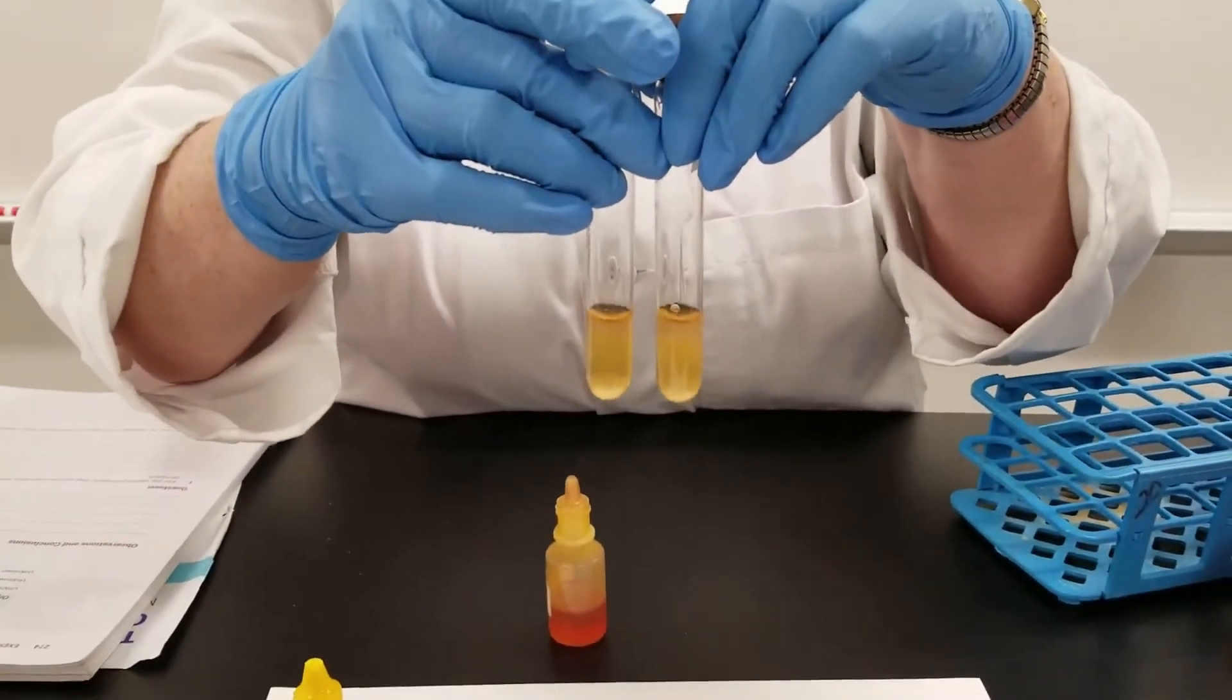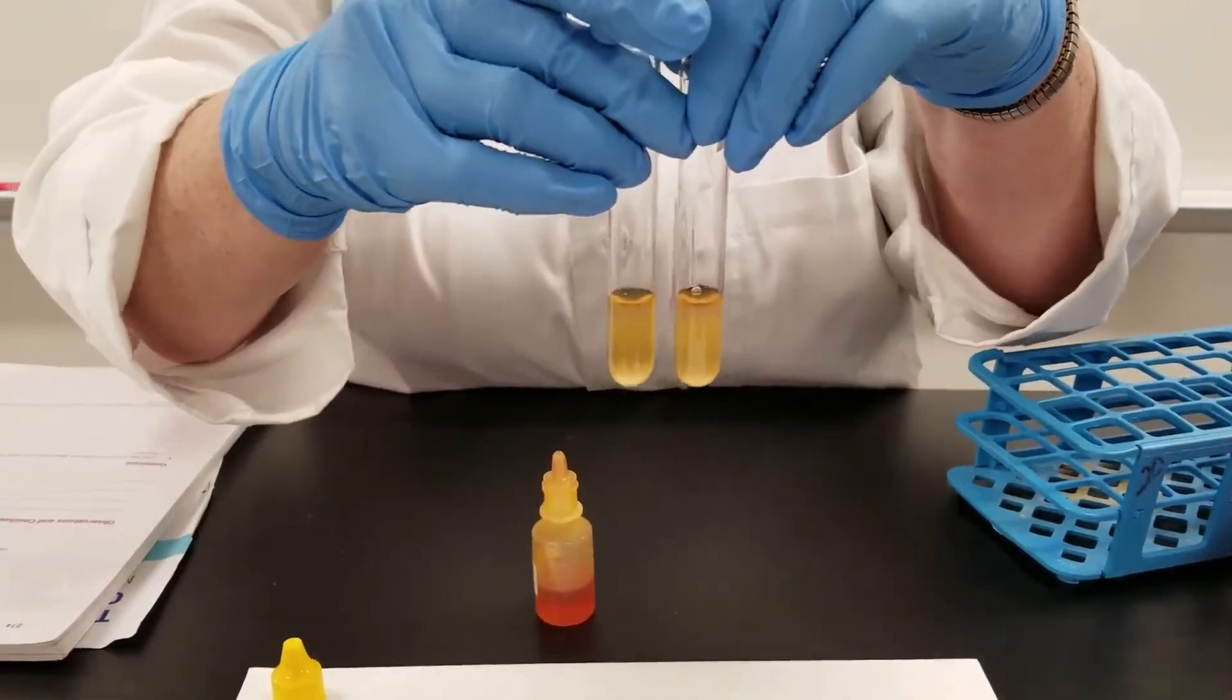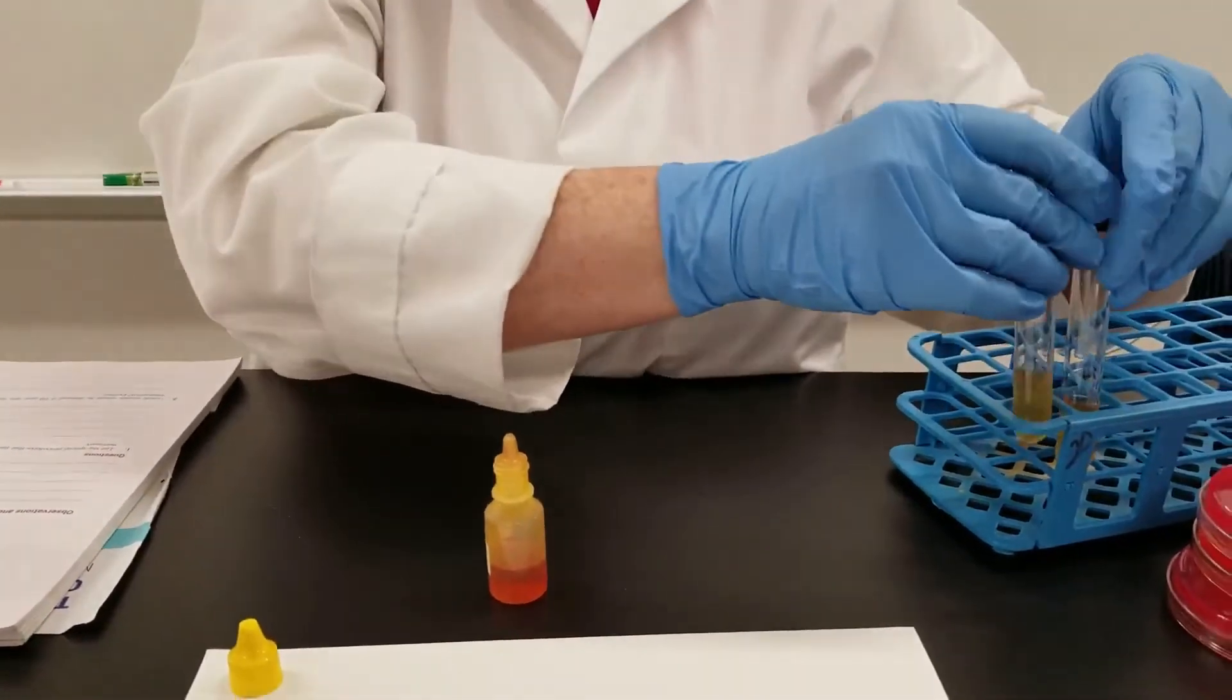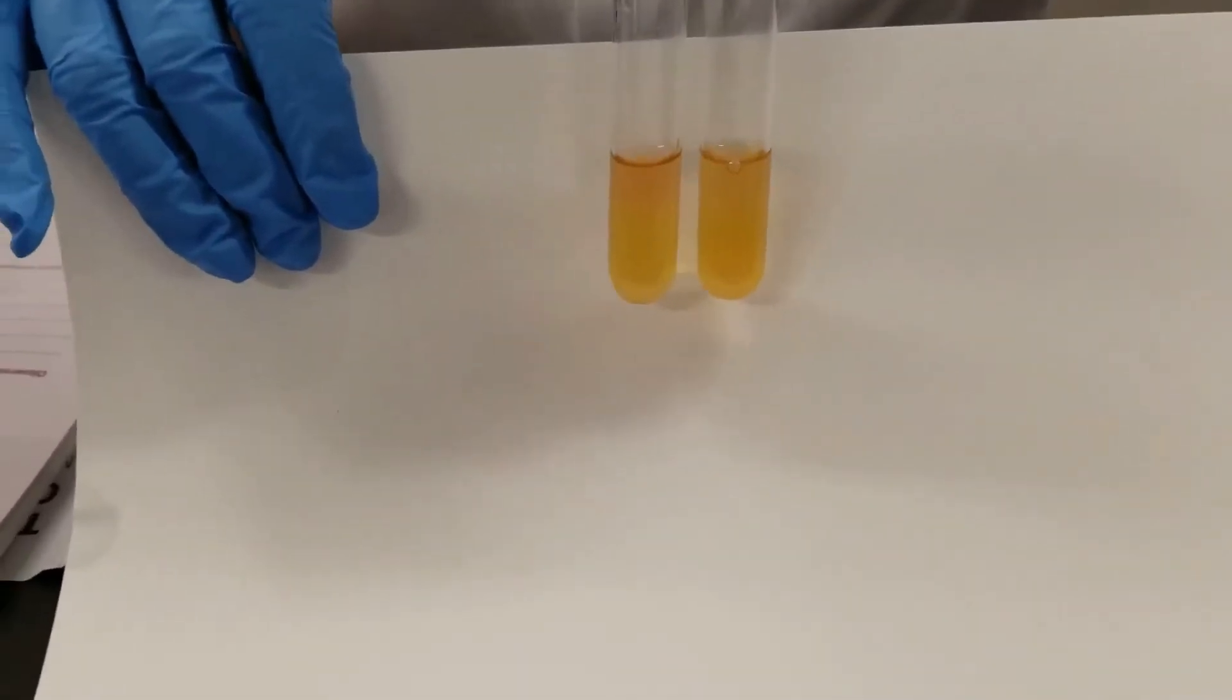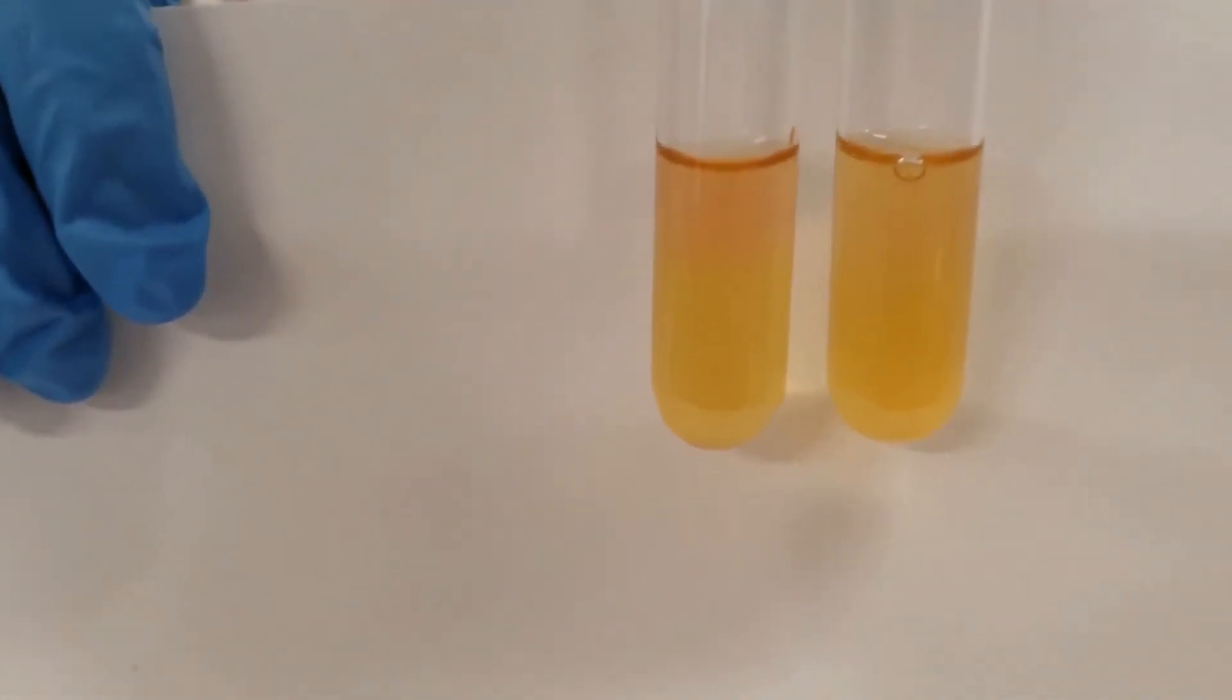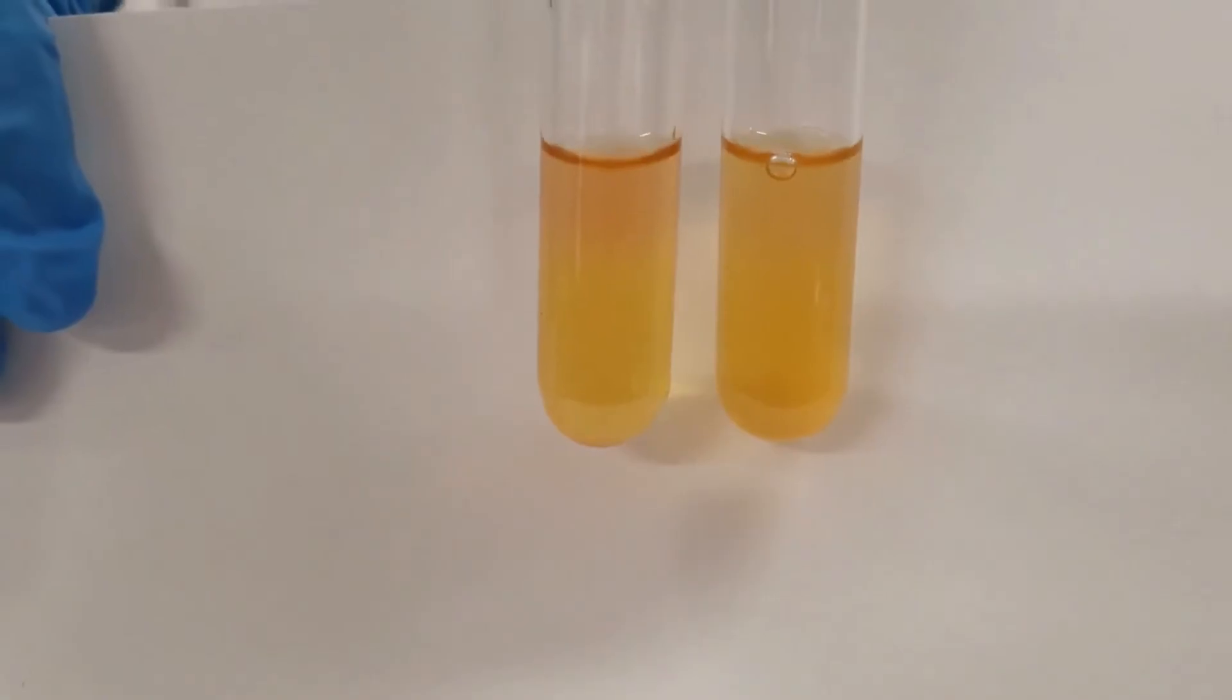Sometimes you may have to add a few more drops or let it sit for a moment. This was the methyl red test after sitting for about five minutes. As you can see, the tube on your left is positive - it has redness to the top layer, versus the tube on the right which has remained yellow and is negative. Red is positive, remaining yellow is negative.